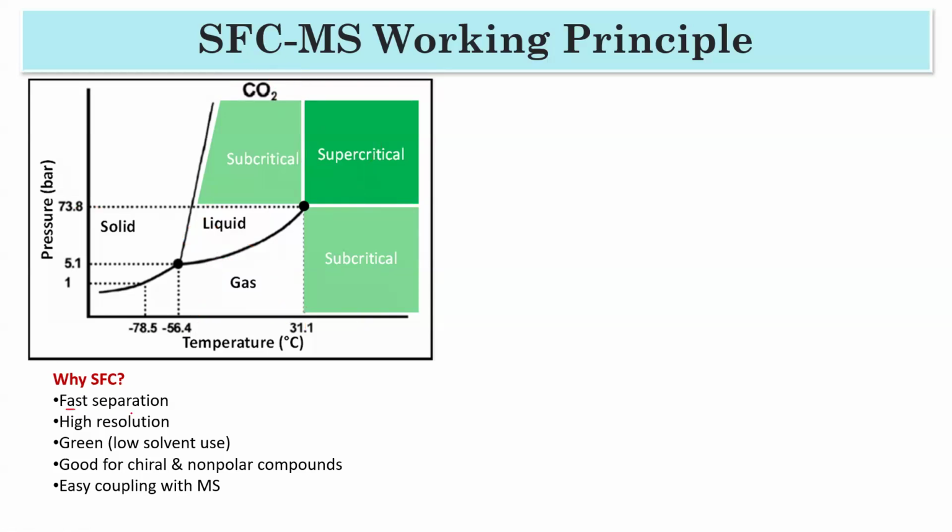The benefit is fast separation, high resolution, and it is green. Why is it green? Because in LCMS, we can say you are using some kind of liquid, which is an organic solvent. So it is not good. But in this case, you are just using carbon dioxide.